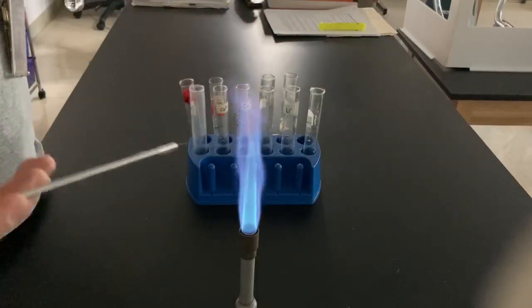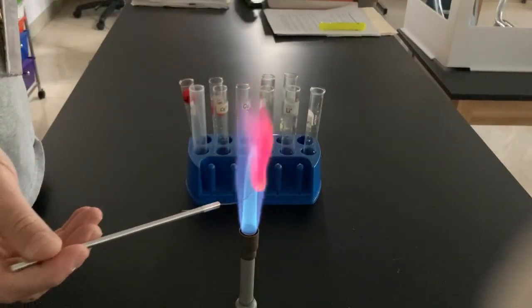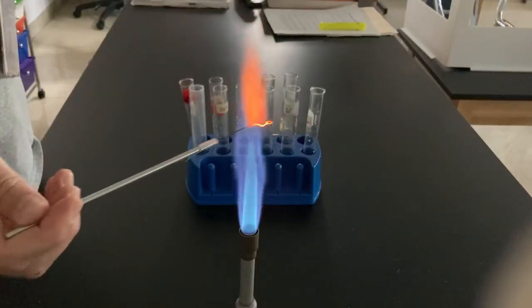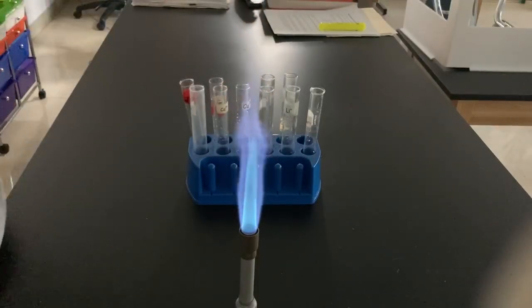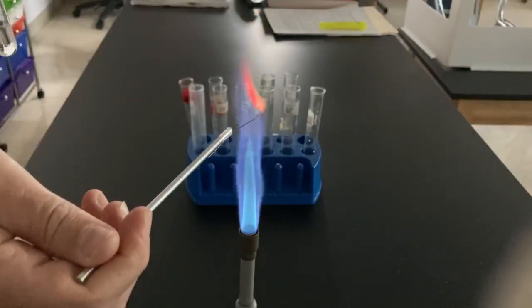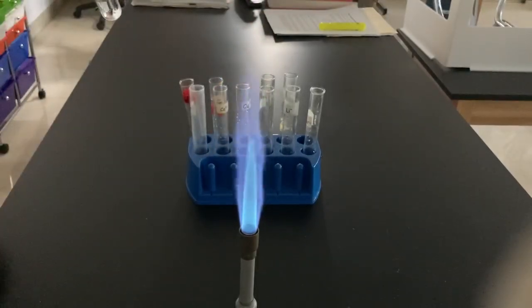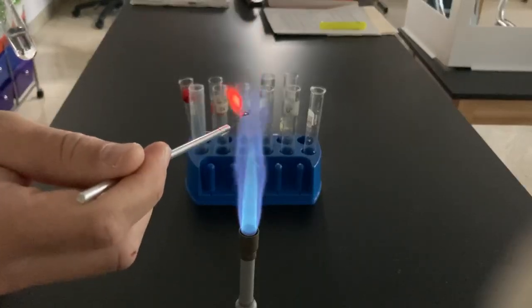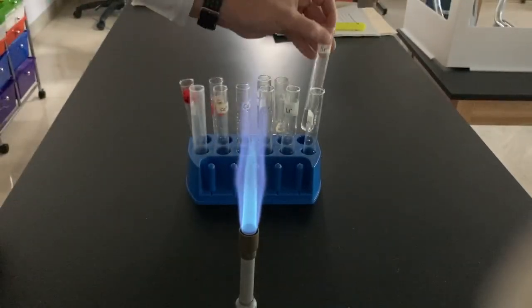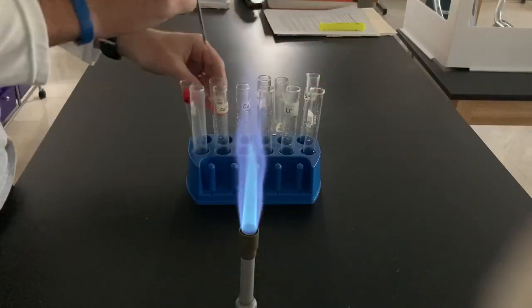Just cleaning my nichrome wire between each use. Clearly I need to burn off some of those substances and put it back in that nitric acid a little bit. And last element — actually, strontium. Kind of a reddish color for strontium. I realize I skipped an element; I'll come back to sodium, don't worry. Strontium again — good reddish color there. Kind of a lighter red than lithium was; lithium was more of a darker red.